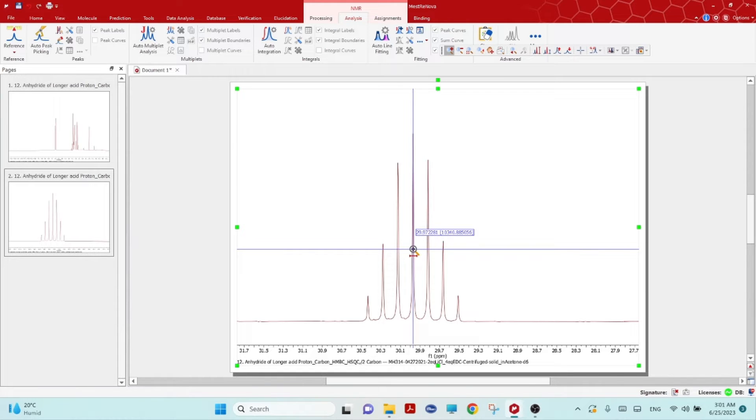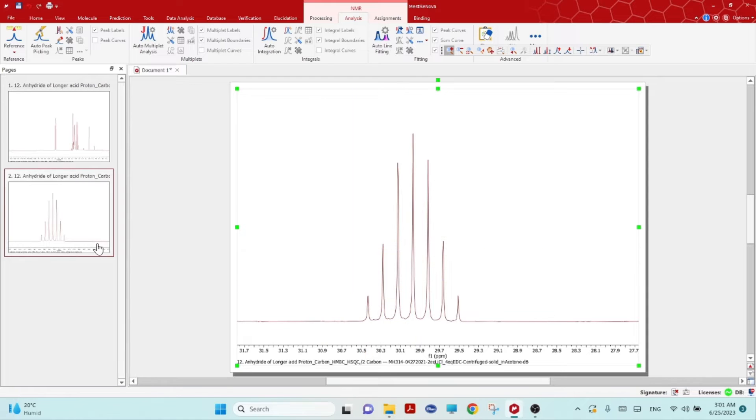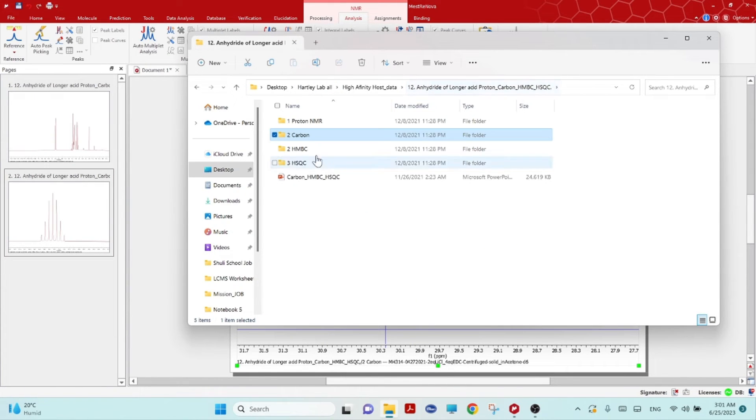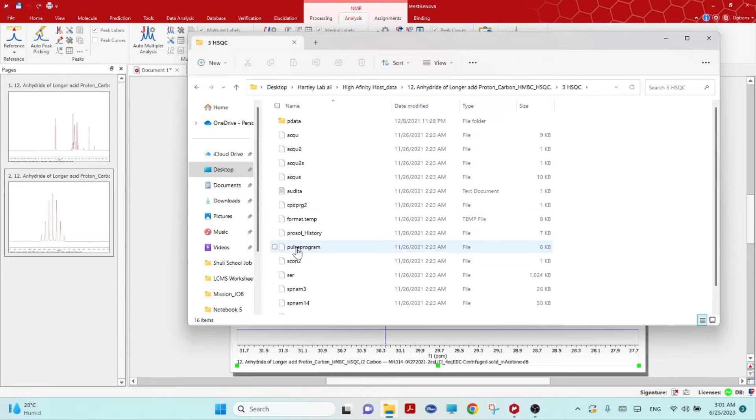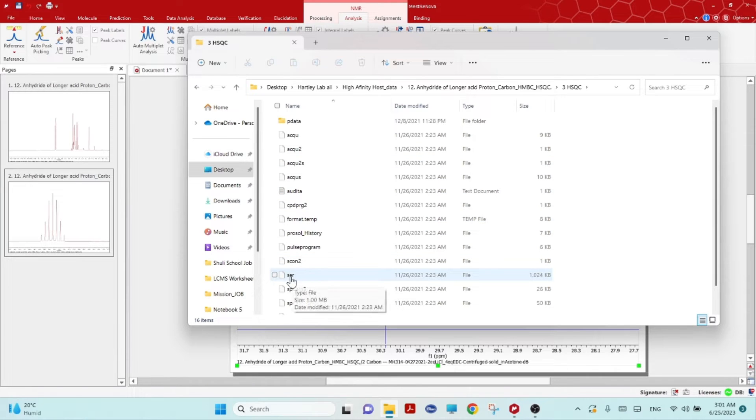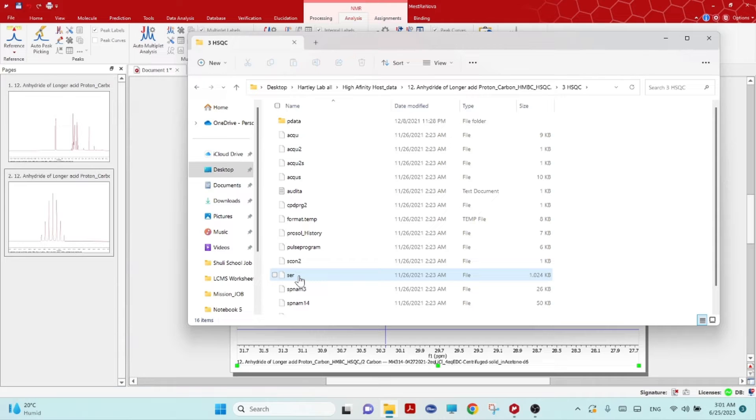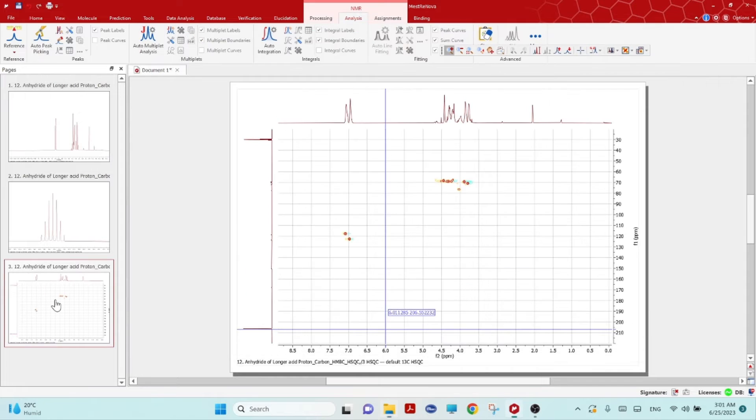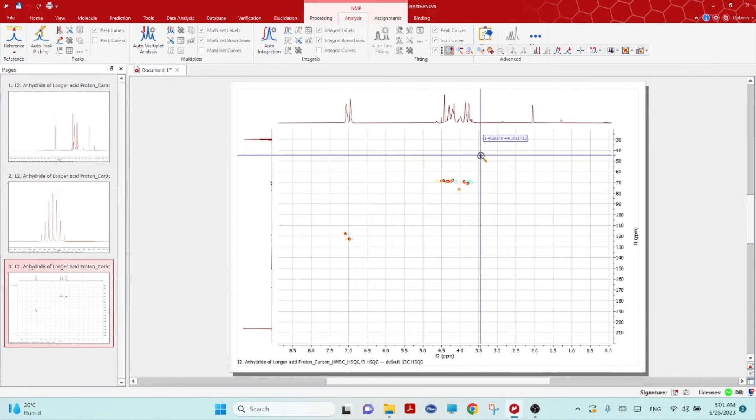Now go to the NMR location and open the HSQC. For the HSQC or 2D NMR you will not see any FID file but you will see a SER file. Click that SER and then just drag it in this area and you will see your 2D NMR opened.